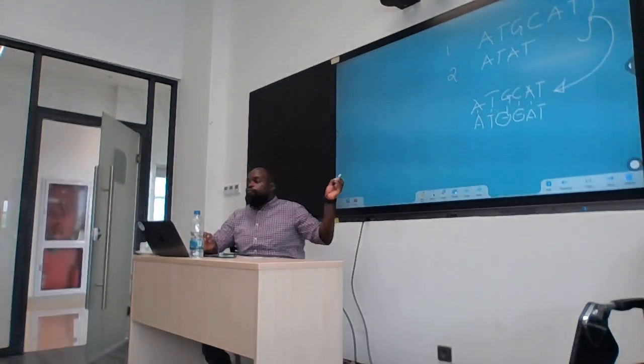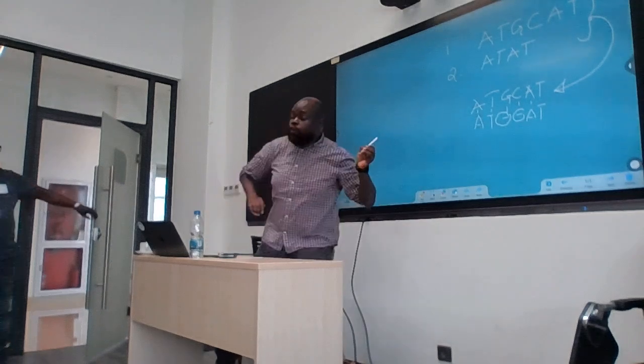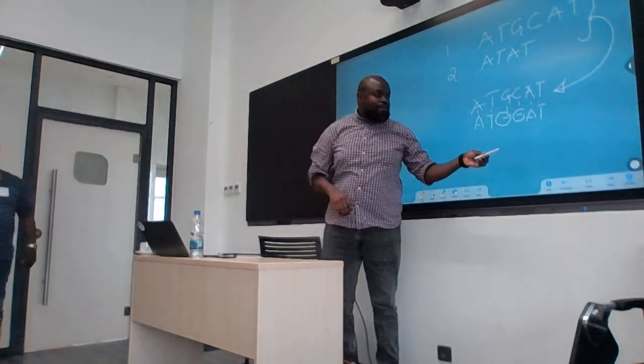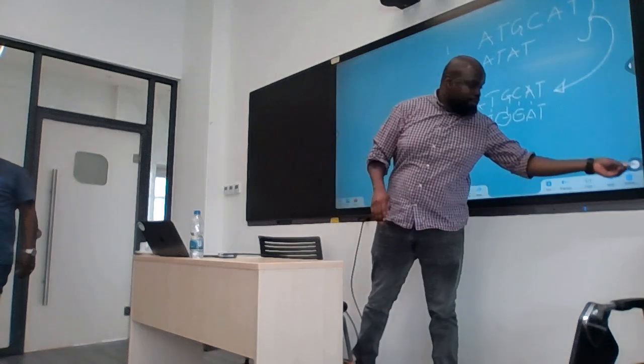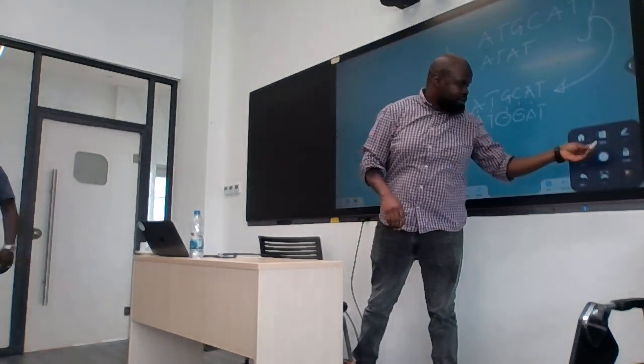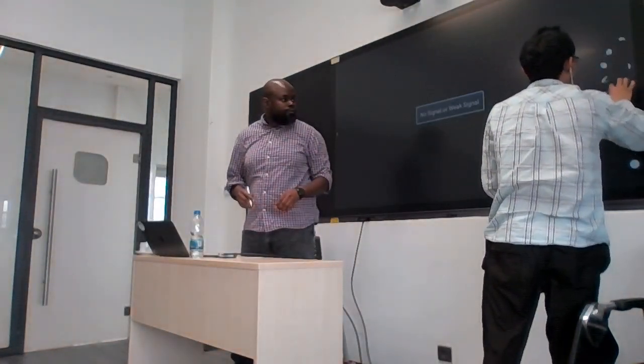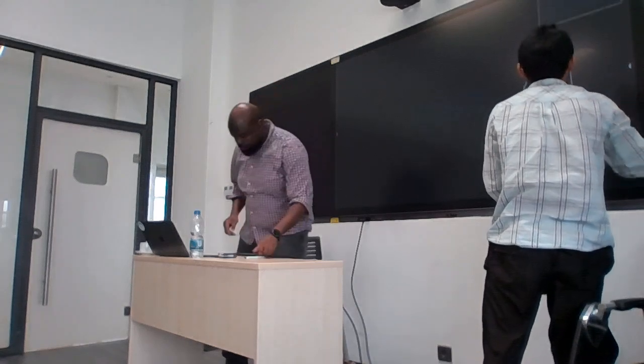If you're not aware of what most of those options mean, a tool might give you the simplest way of doing your analysis. This is what MAFFT is doing.